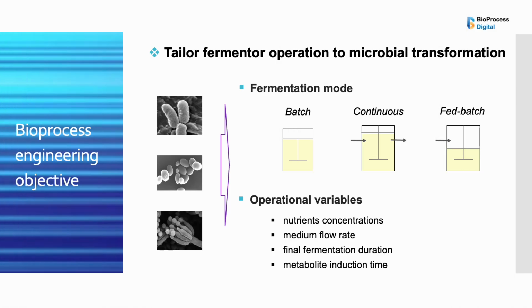A well-designed fermenter must be specifically tailored to the microbial biotransformation of interest, with careful consideration of the organism's kinetic and physiological characteristics.